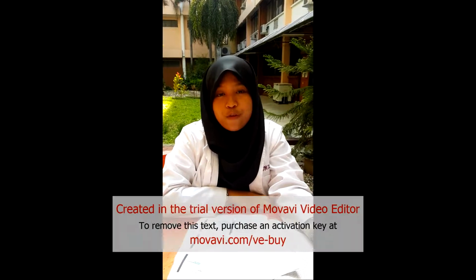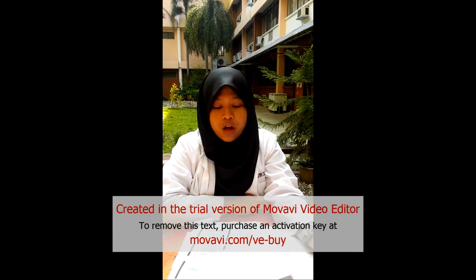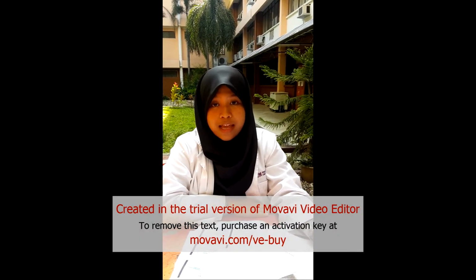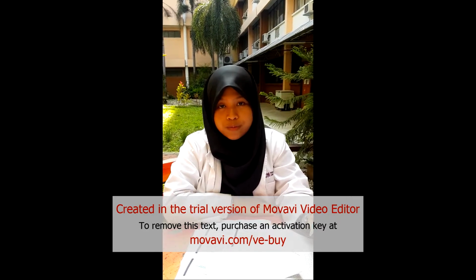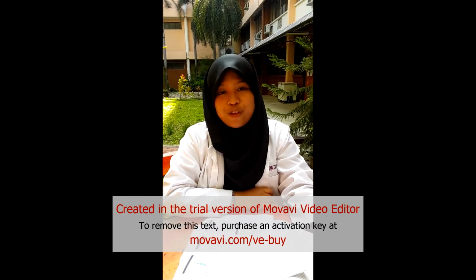Talk about the limitations of photobioreactor. The limitations of photobioreactor are difficult to control the culture temperature in most tubular photobioreactor. Although they can be equipped with the thermostat to maintain its temperature, this could be very expensive and difficult to implement. Another disadvantage is adherence of the cell to the walls of the tubes. Lastly, the increase in pH of the culture will also lead to frequent recarbonations of the culture, which will consequently increase the cost of algal production. That's all the limitations of photobioreactor.